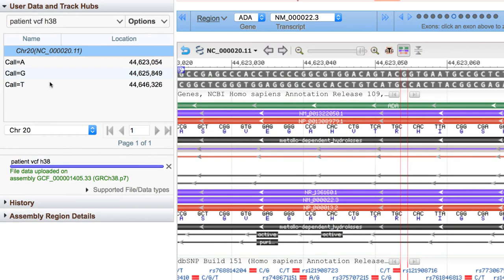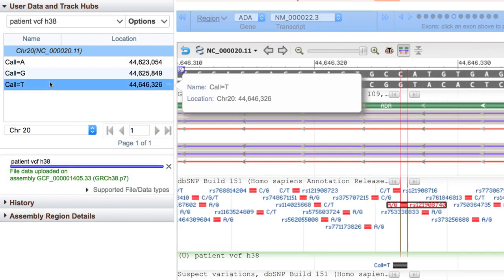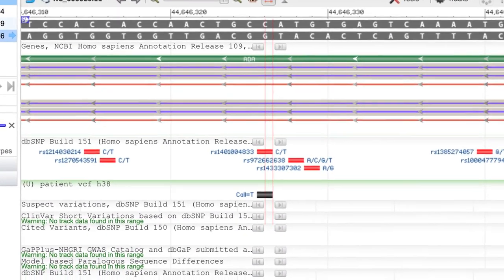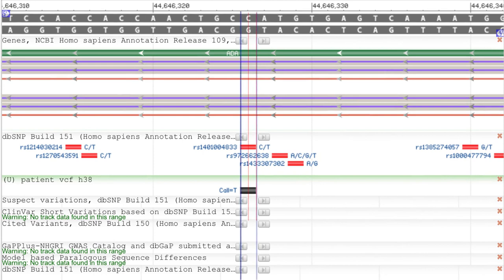Our final call is this T, also in the ADA gene, and corresponding to a refSNP. We see no data in these tracks, nor in the variant table below, but there is another track we haven't explored yet, a fairly new one called Biological Features.